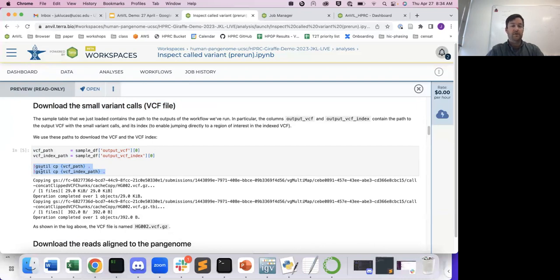And what's really nice about that is that as you have a workflow, and maybe you've got a WDL and you don't want to mess with it, you've got results that you want to be able to inspect. You can do that in a Jupyter notebook. If you wanted, you can start plotting with matplotlib, or you could even filter the VCF by hand just to play with it. Then you can upload that back up to the data table.